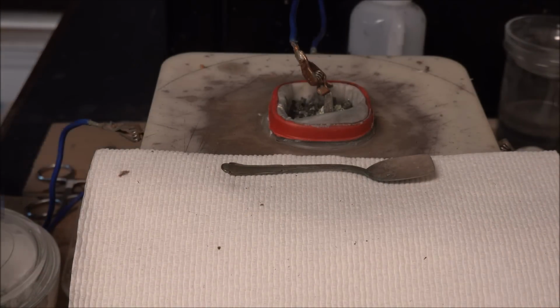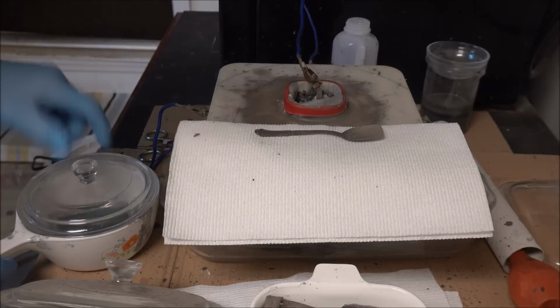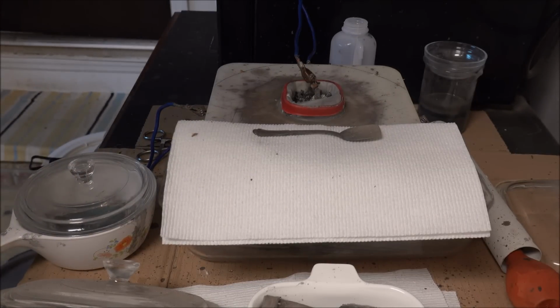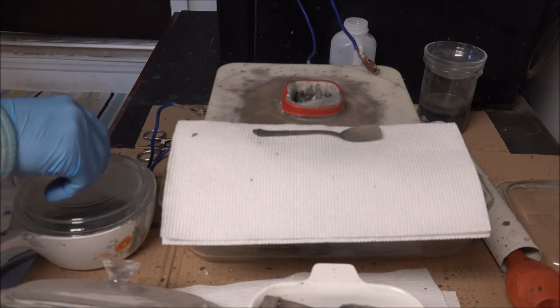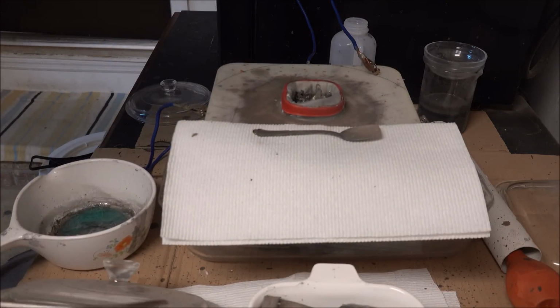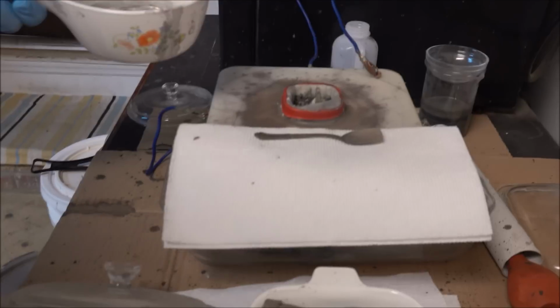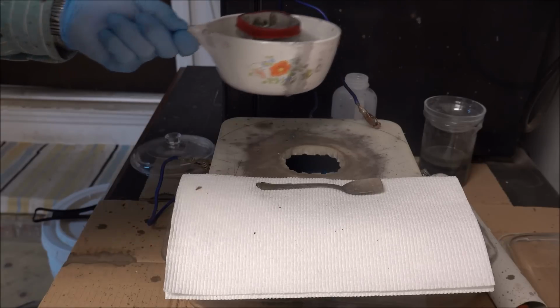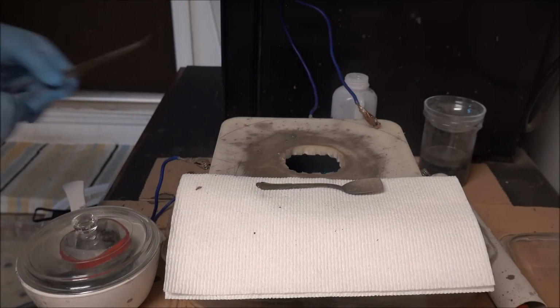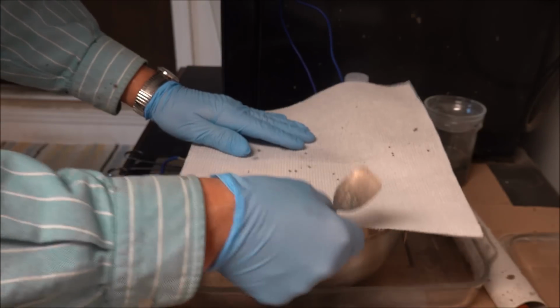Let's see here if I can pull this back so you can watch what I'm doing. What I'm going to do here is I've got a little Corningware dish with a lid on it. First I'm going to turn the power supply off, remove the connection, and then I just take a pair of tweezers here, grab a hold of the filter, just pull it out and stick it right in here like that, cover it up, and then we'll just use this paper here to cover the cell, keep anything from falling down in there, and then get this silver crystal out of here later on.